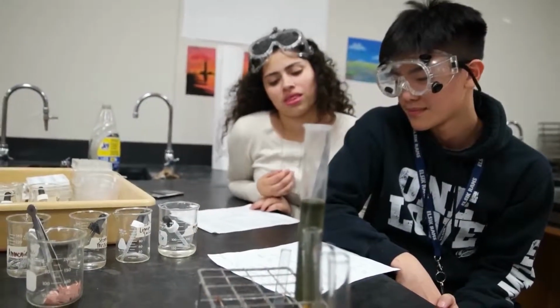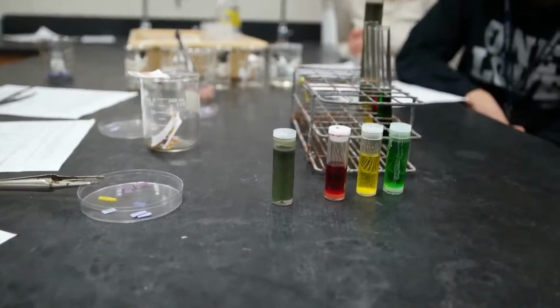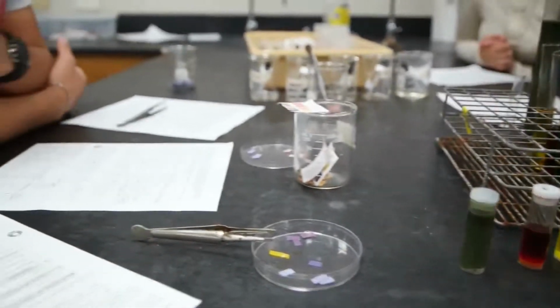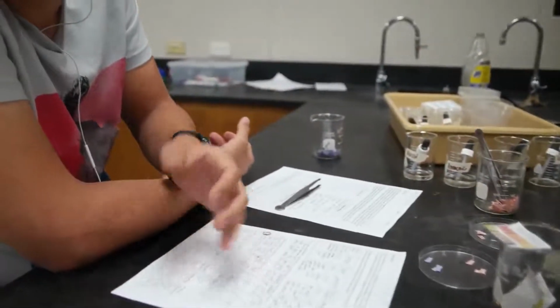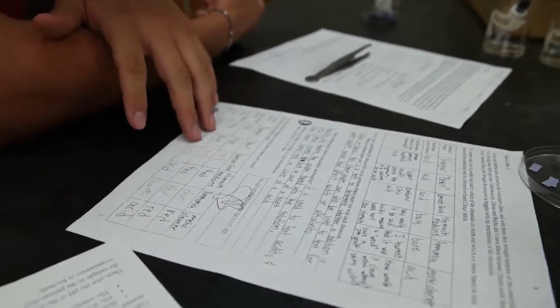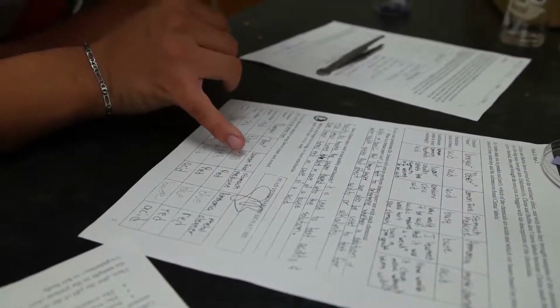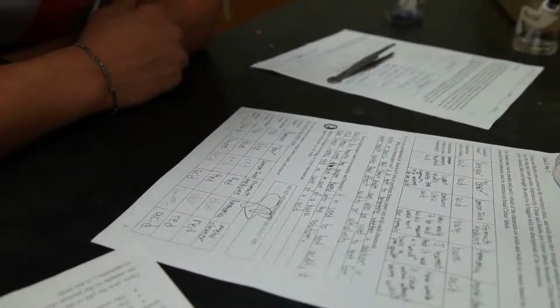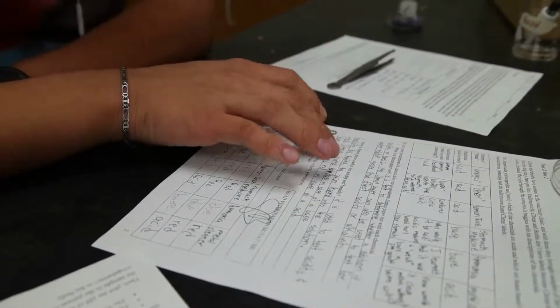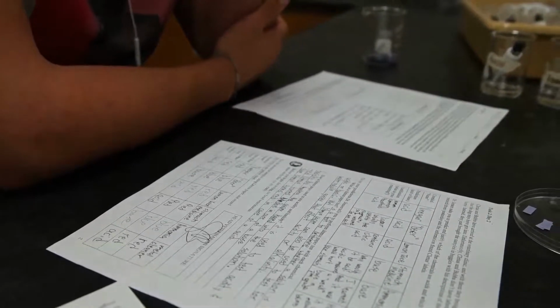And then what did you do after that? After that, we just recorded all of our data onto our sheets that Ms. Baig gave us. We determined whether the chemicals that the dog ingested were acids or bases. And after that, we're just waiting to do more.